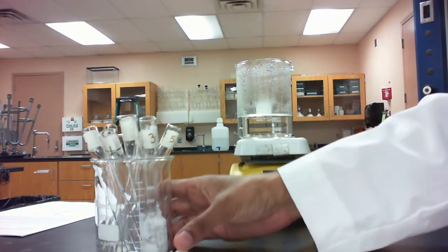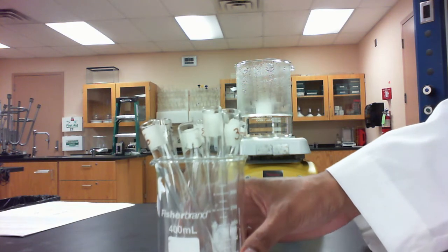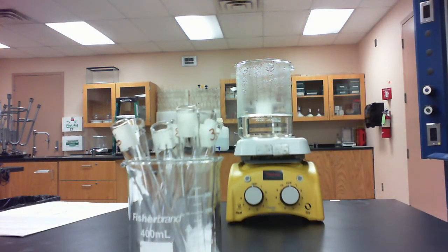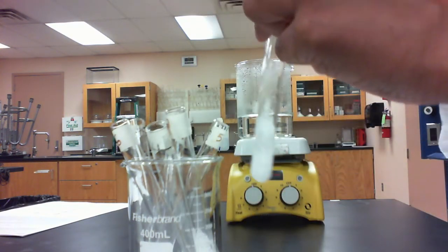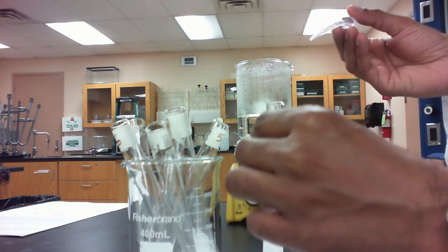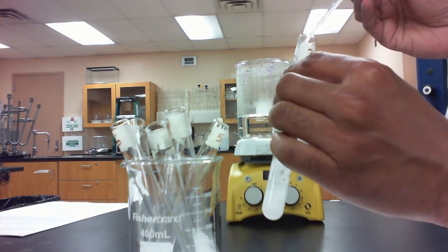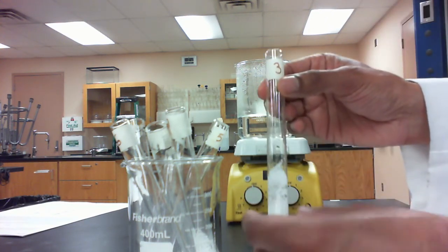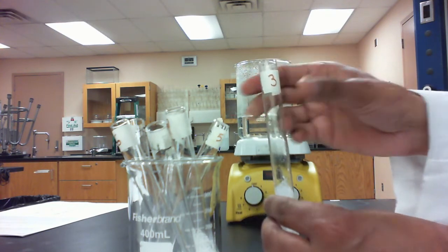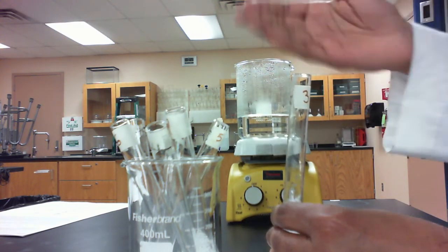So after removing our test tubes from the water bath and allowing them to cool a little bit, we're then going to add a little bit of deionized water to each of these tubes and then try to detect the smell of the ester. For instance, I've just taken out test tube 3. I'm going to add a few drops of water in here. When you detect the scent of anything in the laboratory, you want to make sure that you do it properly, and the proper way to do that is to gently waft the vapors towards you.